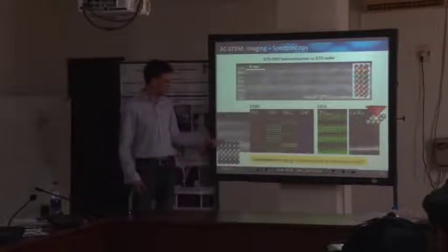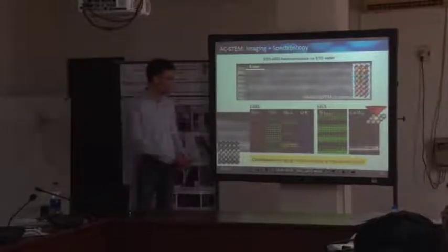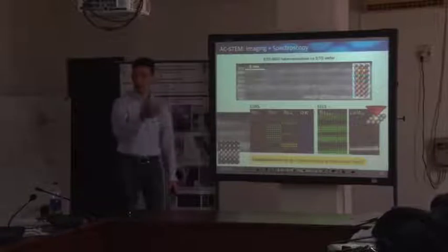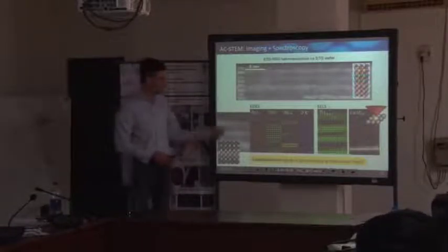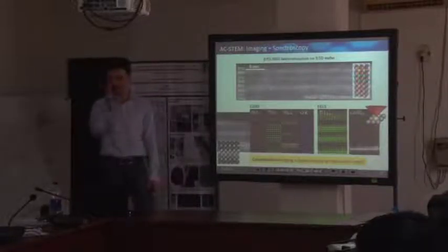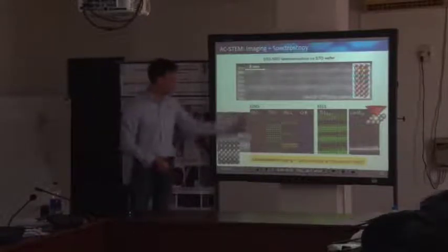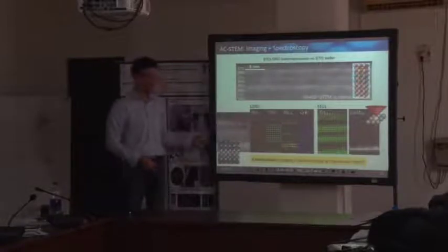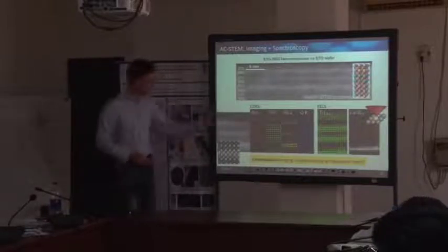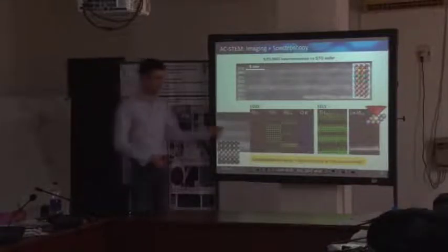So this was just raster scanned 1,000 to 10,000 times or so, to average the signal and to integrate all the spectra during recording this data set. It's not common to leave your electron probe on one atomic column for 1 second or for 1/10 of a second and then go to the next. But what you do instead is scan the whole region of interest very quickly, and then you apply some drift correction. So you record another image from an adjacent site to compensate for drift, because if you don't do so, I mean, we are on the atomic scale.